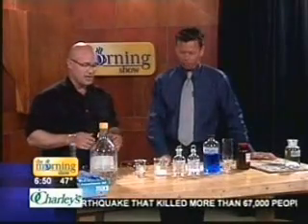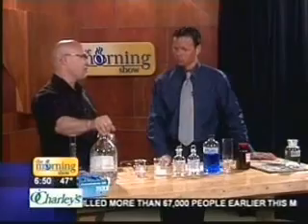Okay, well, we have a classification of acids. We have strong acids and weak acids, and the classification is more technical, or jargon for us. But strong acids are ones that dissociate completely, and there's 7 of them, and I'm going to show some experiments with 3 of them. Okay, and the first one we're going to talk about is sulfuric acid.